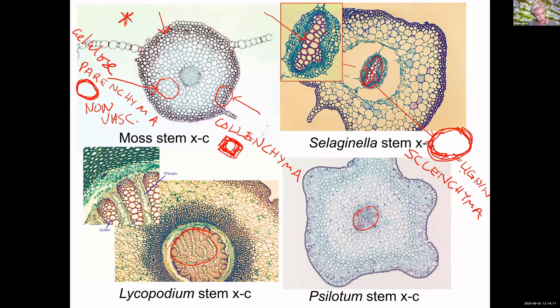So this kind of cell is what makes up the woody tissue in those plants, trees, and shrubs that have a brown type of cells. These cells are dead and empty at maturity. The collenchyma and parenchyma cells stay alive. So there are these vascular tissues. The only reason we can pass the plant body fluid through them is because they're empty, they're hollow, just like pipes or tubes. Some kinds of sclerenchyma cells are alive, but the ones that are part of the vascular tissue are not, the xylem cells.